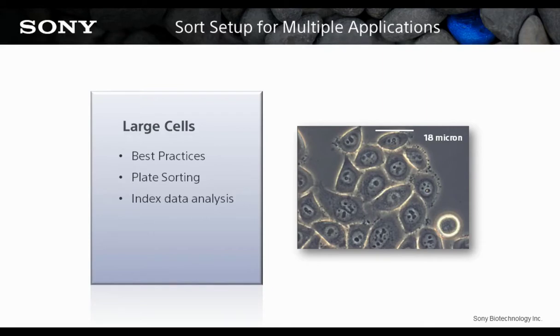For my third topic, I will discuss sorting large cells into a plate, which is yet another application that the Sony MA900 excels at.